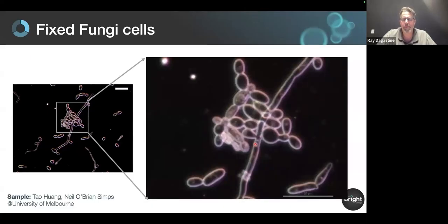And at the time, I went, "Well, why don't we bring it to your lab instead of you bringing the toxic fungi to my lab?" But this is just, from what I understand, a reasonably common fungus, and you can start to see both the cell wall and a lot of the internals, and again, the vacuoles. This is label free, and we're starting to get to objects that are a little smaller.